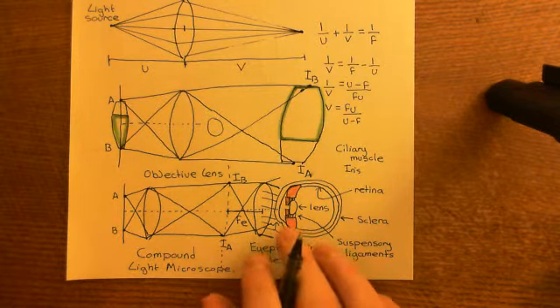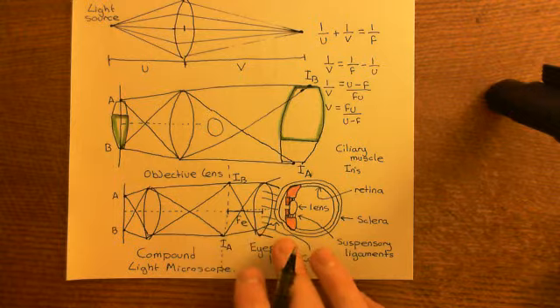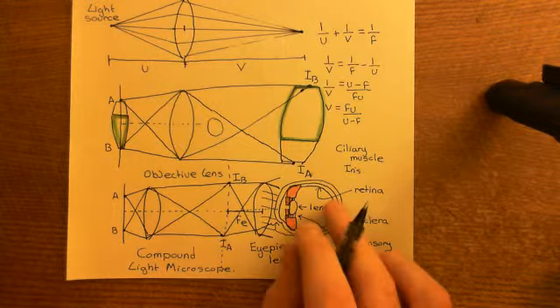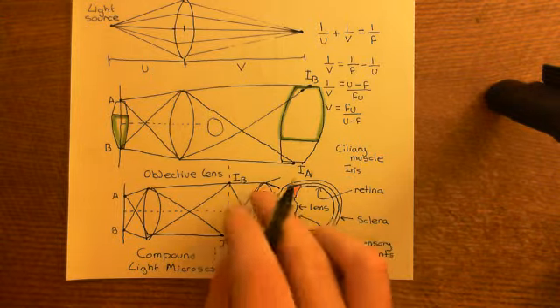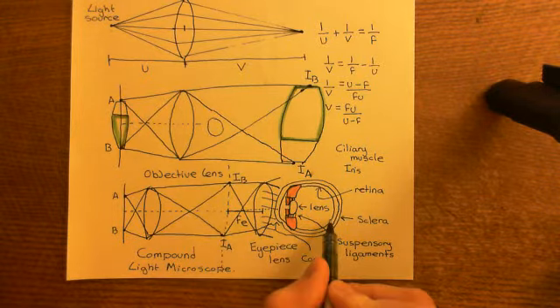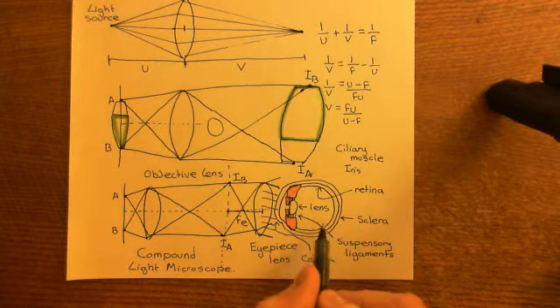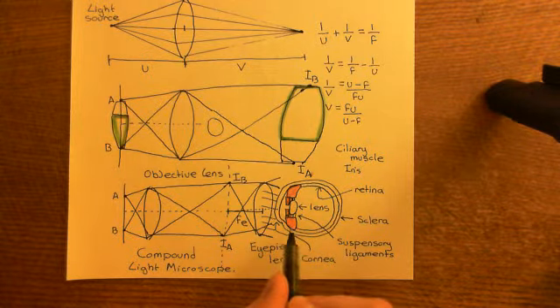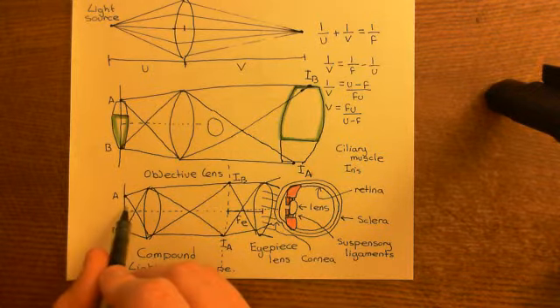This is just what the human eye is designed to do. It's designed to focus light that is coming in horizontally like that, and it will focus all light that is coming in a certain direction onto a specific point for that direction on the retina. So all of the light from a point on this imaginary plane will be focused onto a certain point on the back of the retina. What you have to understand is that this still means the image is inverted, because the image that the retina is getting is still an inverted image.